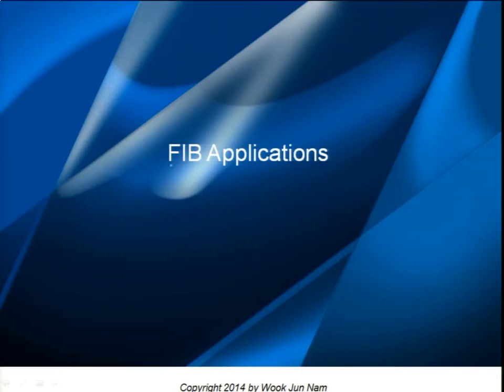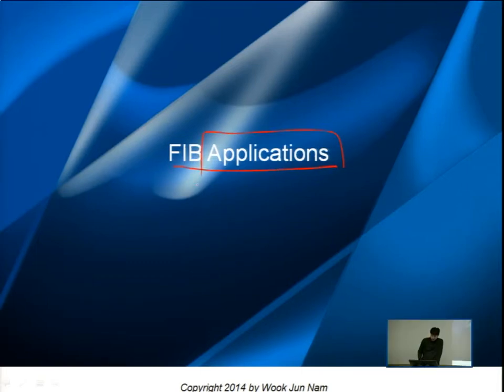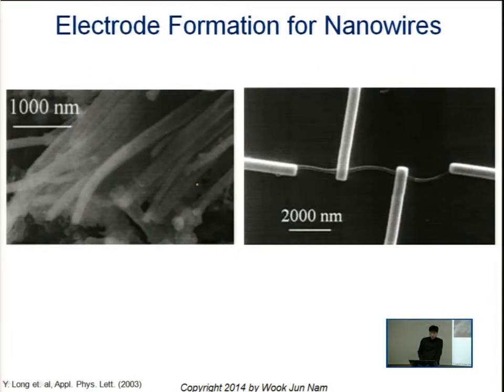So we're going to talk about the focused ion beam application. In the material synthesis sections, we talked about the VLS technique.